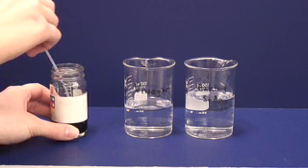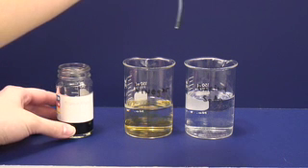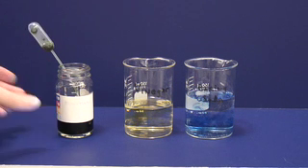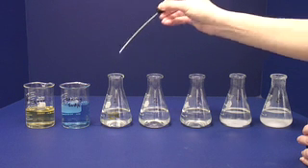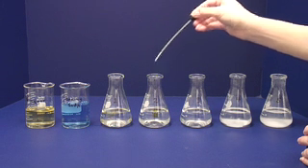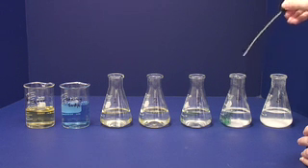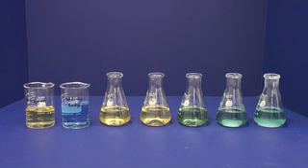This is bromothymol blue, an acid-base indicator. When added to vinegar, it is yellow. When added to a water solution of baking soda, it is blue. Now let's add the bromothymol blue to each of the flasks. What do these colors suggest about the contents of each flask?